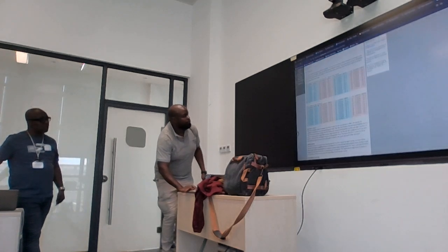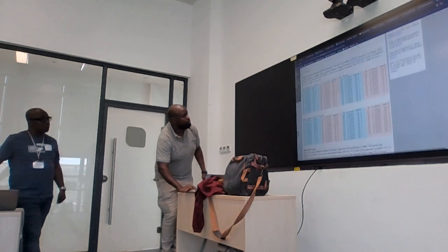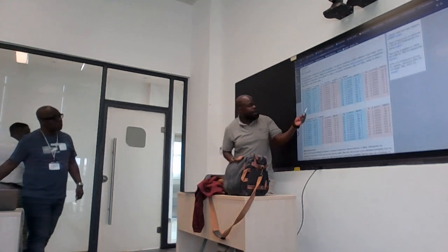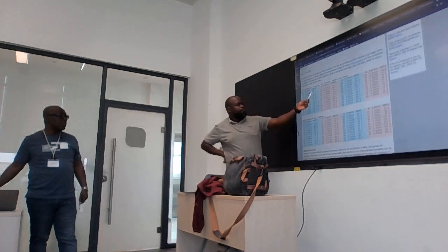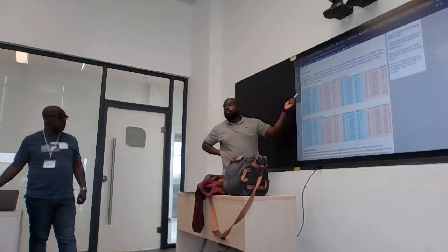Okay. You can see here, for example, we have here is a character, okay? This character, the exclamation mark, has been assigned a quality value of 0.